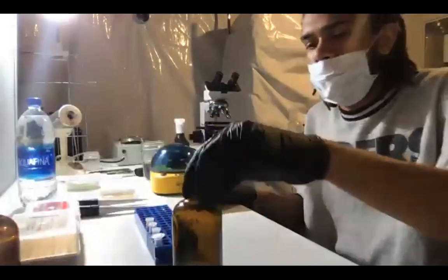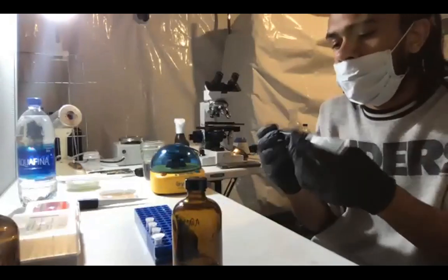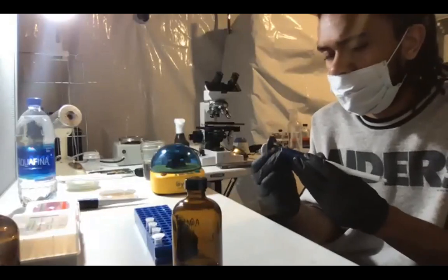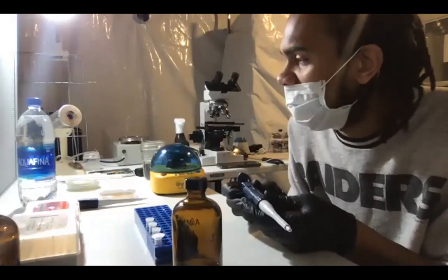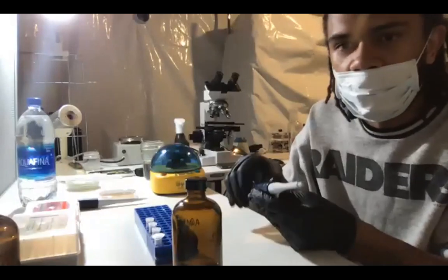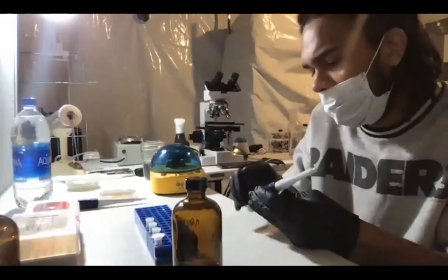All right, so I'm gonna go with 100 microliters of the extraction solution. So this is very basic. Distilled water will work. You want like distilled reverse osmosis. Like you want it to be as pure as it possibly can be. Like don't use spring water or anything like that. You don't want a lot of minerals or anything like that in it either.